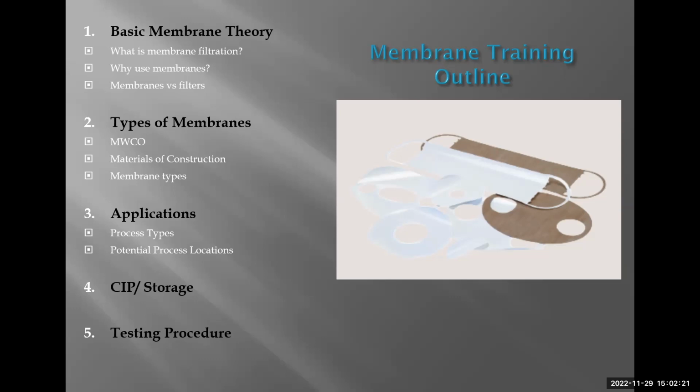We'll go into different types of membranes such as molecular weight cutoff, materials of construction, membrane types. Then we'll go into applications such as process types, potential process locations for membranes. Then we'll go into CIP and storage of membranes before we go into a very basic testing procedure that I like to use for membranes before we actually start running them.